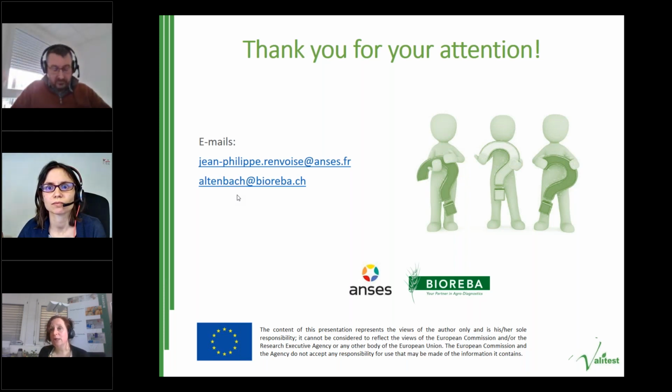What we generally do is validate as much as possible, but we give the information on what was tested in our product information. You could check, for example, if we indicate it works for testing in lily or potato or whatever. And if you have a question, you can contact us. If you test a different host, sometimes we have additional validation data and do not present all of it. That's how we approach it in general.